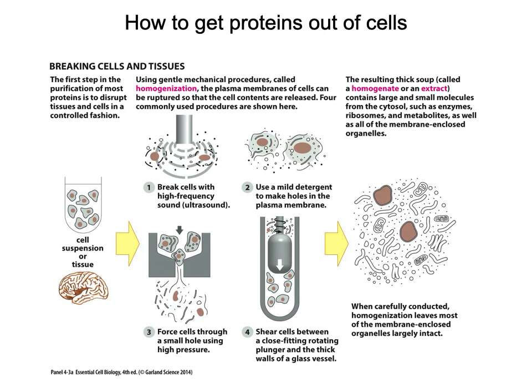And in order to create a homogenate or an extract, there are four different common methods, and you can see that in the middle of that figure. We have these four different methods. One method that's used is taking the cells and treating them with high frequency sound, or ultrasound, so that can help to break apart the cells. The cell membranes are destroyed, so all that material that's inside the cell is released. That's a specialized piece of equipment, so probably not as common.